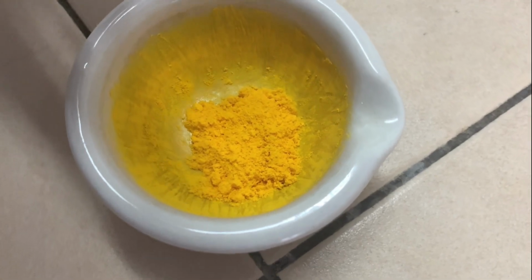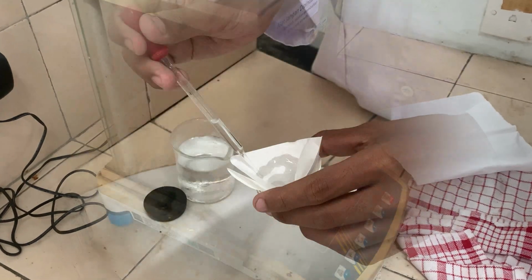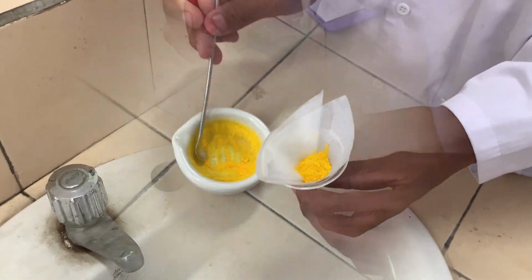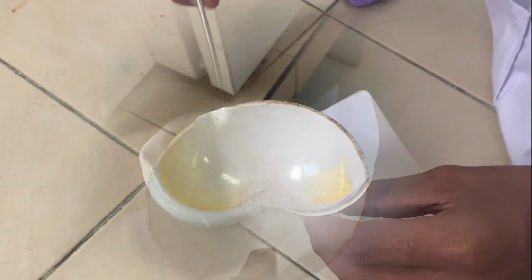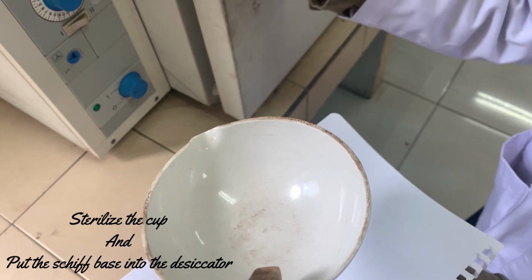Then, weigh the filter paper and wet the filter paper with cold water and air it. Put the product into the filter paper and clean the rest of the product in the mortar with a little cold water. Sterilize the cup and place the product in a desiccator for 1 week.